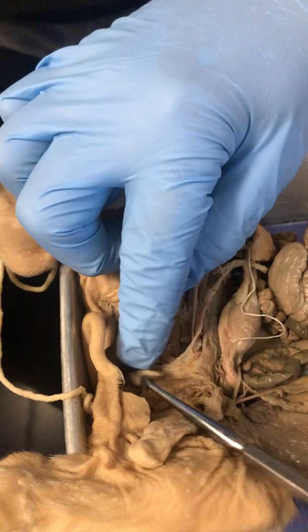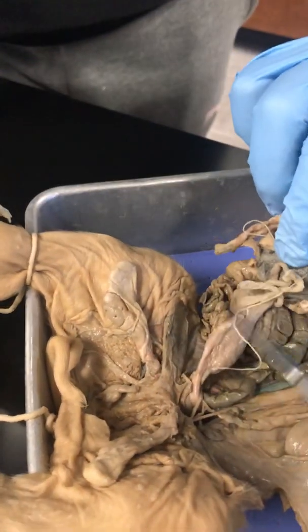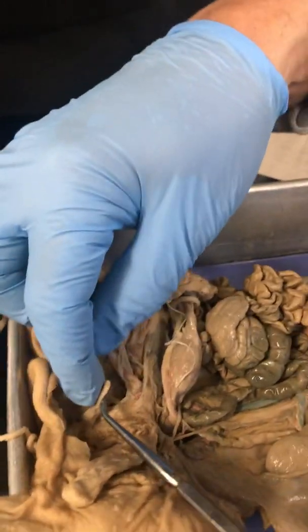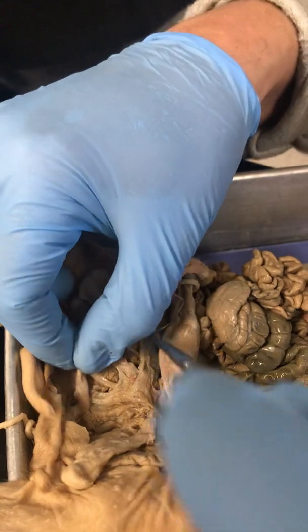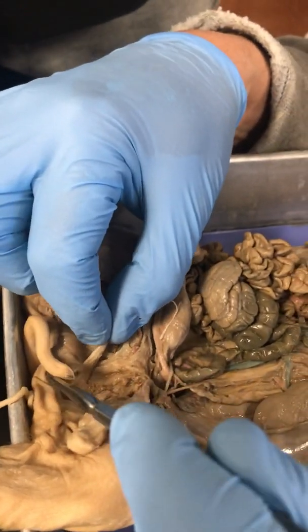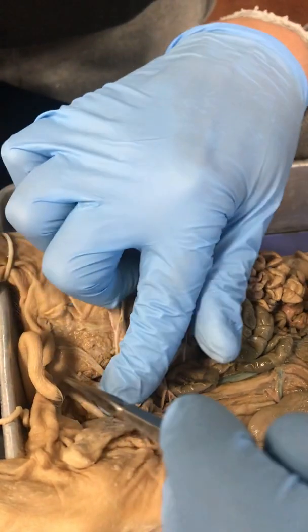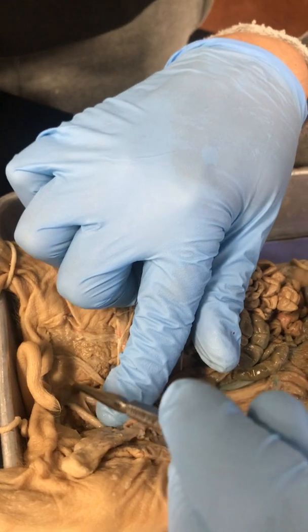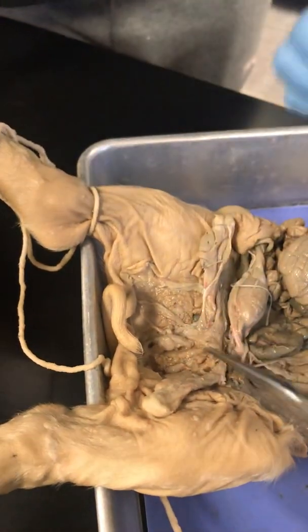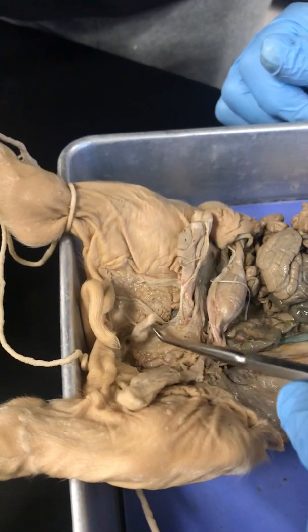You're not going to ask about the penis, because it's hard to determine where it is. I think what happened is they cut the penis out. We were looking for it. This is probably the remnant of it, right there. And if you go down here a little bit further, I'm surprised they didn't quite go down far enough, but you can see the bulbourethral glands. They're actually fairly good size in the pigs, and they're on either side of the bulb of the penis, at the base of the penis right there. But they've actually cut it off, unfortunately.